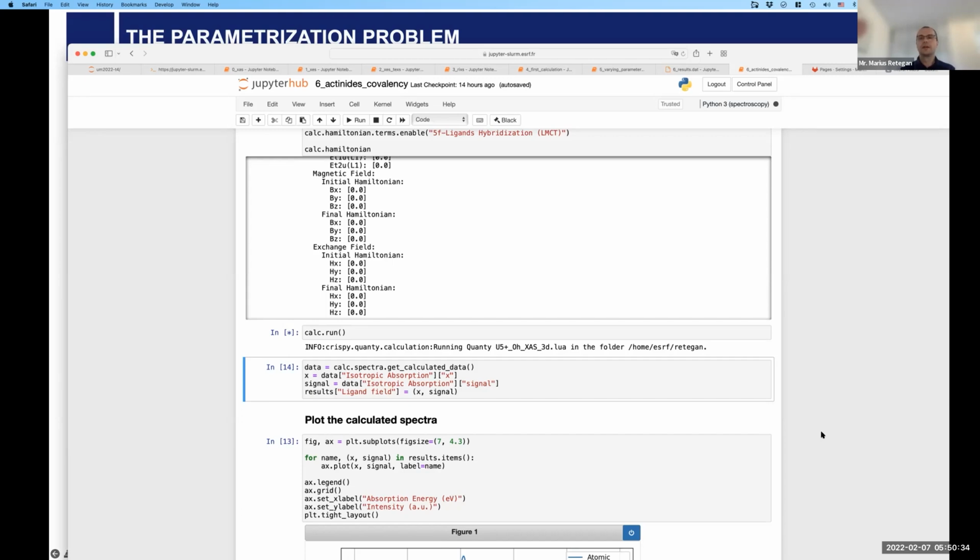I agree. From your perspective, the best thing to do is to have more extensive documentation. For me, in the end, I'm a little bit old school. In the end, I will use one with a graphical user interface, I guess. Because this is when I use Larch, for instance, or also Athena. Now I was thinking to use more Larch because it seems to be a little bit quicker and more modern.